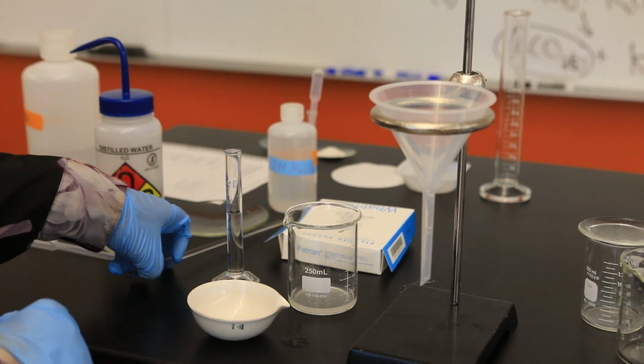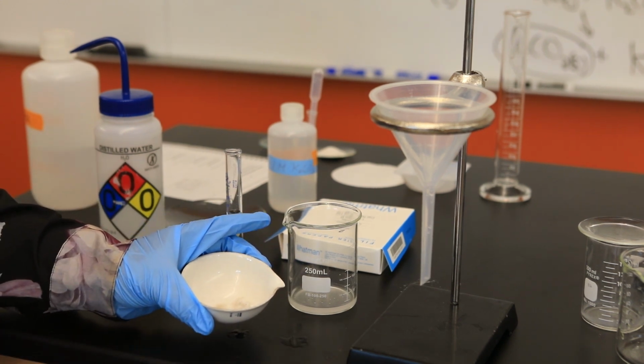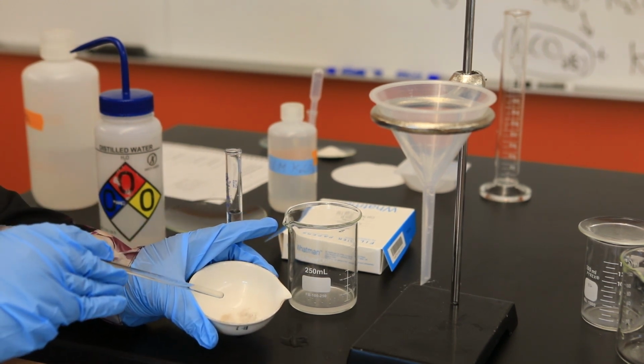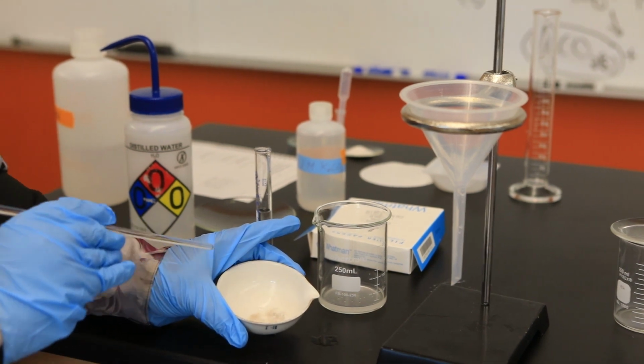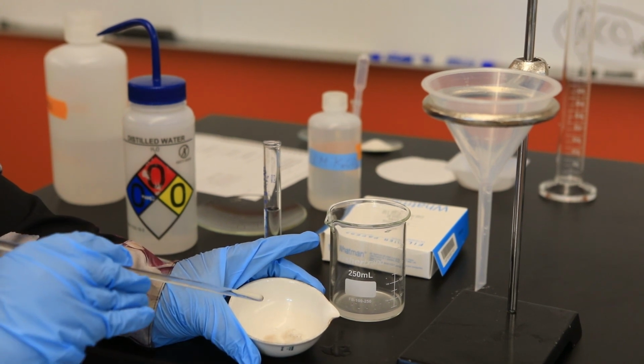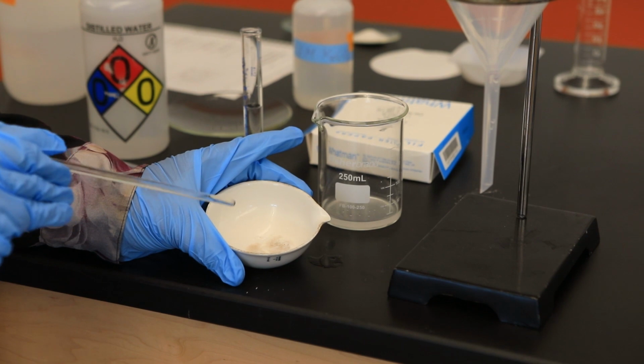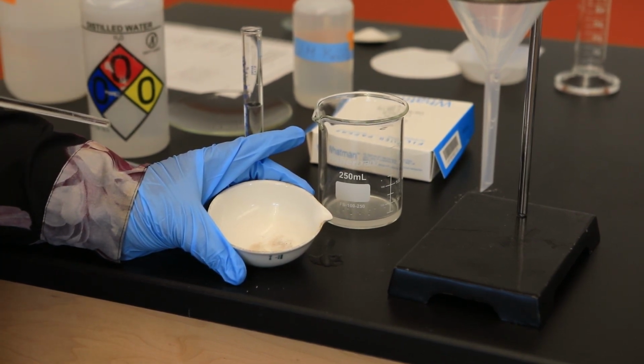Alrighty. So now inside my evaporating dish, we have what? Just a small amount of calcium carbonate, a white powder, and sand. In my next step, this is no longer a physical means of separation. This is now going to be a chemical means of separation.